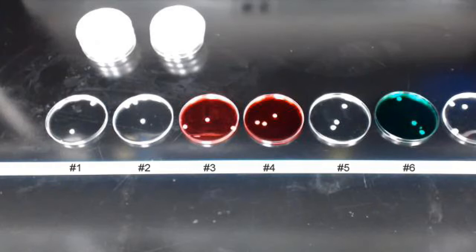Number 6, 1% hydrochloric acid. Number 7, Listerine. Number 8, Lysol. Number 9, bleach. Number 10, hydrogen peroxide. Number 11, tincture of iodine. And number 12, saturated aqueous iodine.